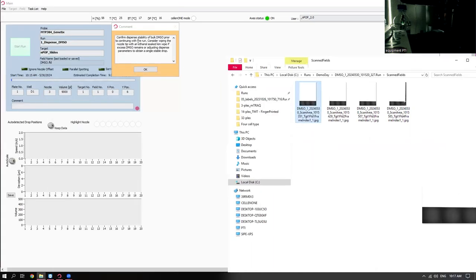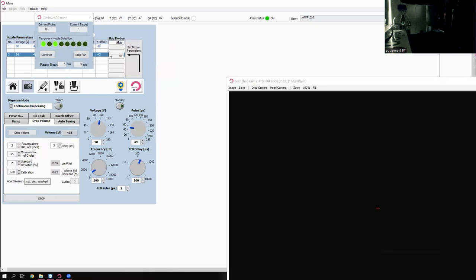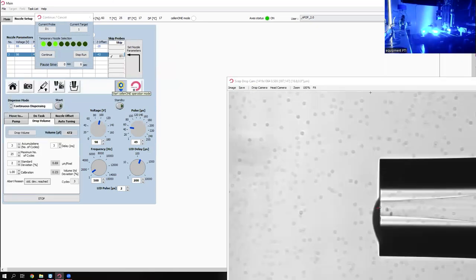Now it says, confirm dispense stability of bulk DMSO prior to continuing with the run. Consider wiping nozzle tip with ethanol soaked Kim wipe if excess DMSO remains, or adjusting dispense parameters to obtain a single stable drop. So we press okay. We've already aspirated the DMSO. We have it here in nozzle 3. We're going to take a look at it.